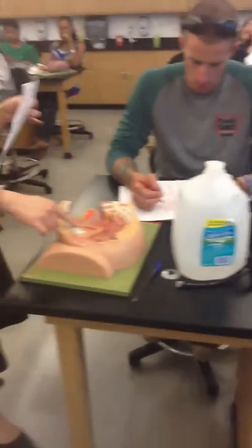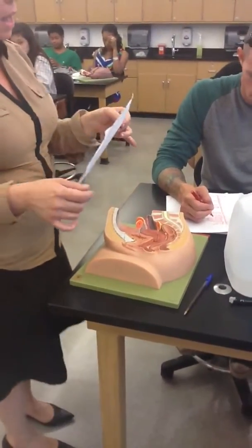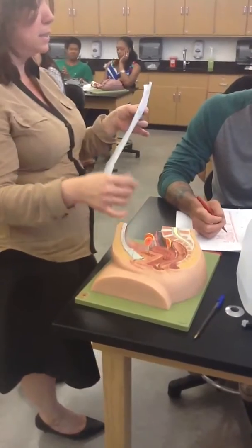Number 7, already we talked about, I put for you number 7, kidney slides with the glomerulus, okay? So number 8, what is number 8? Number 8 is the urinary bladder on a female reproductive.